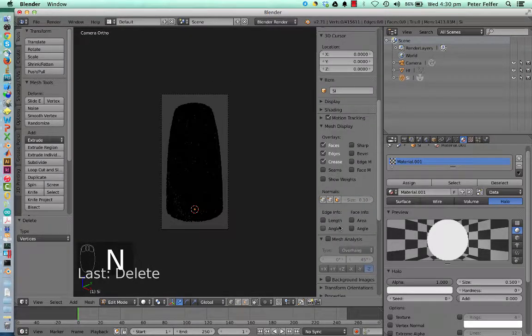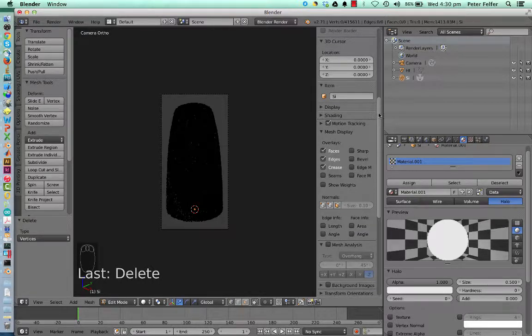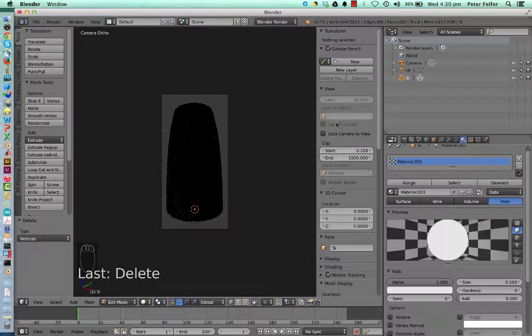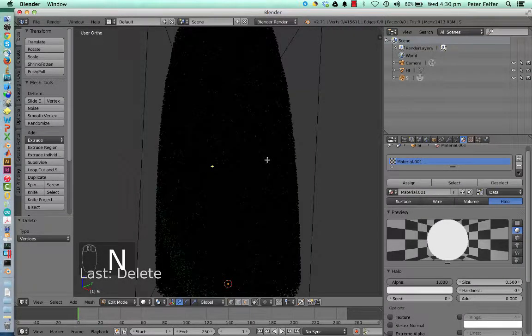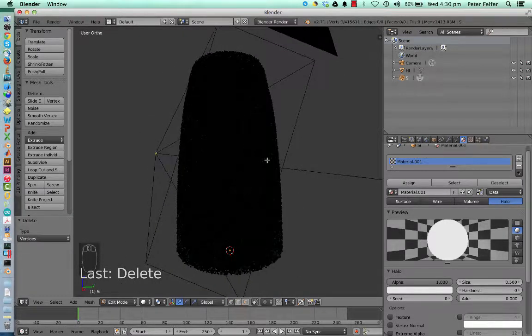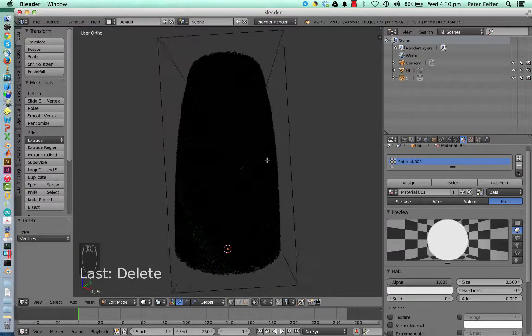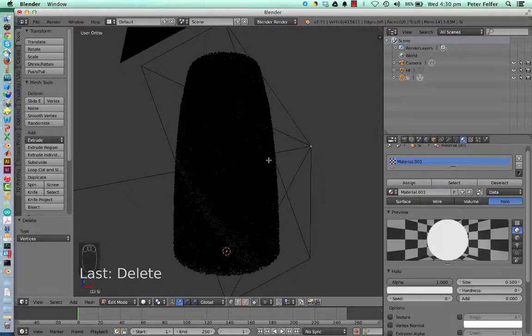Sorry, I'll just make sure that we're not going to change the position of the camera anymore. So if I go up, oh, that's unticked already. It's good. So I don't need that anymore. You can see now it's still not zippy because it's trying to remember for the next couple of steps where those vertices were in case we wanted to go back. But you'll see in a couple of steps it will speed up.